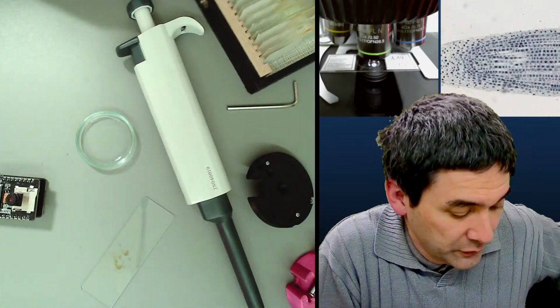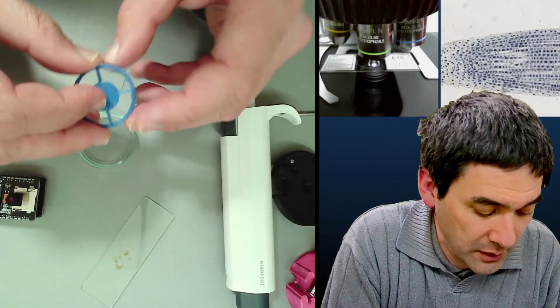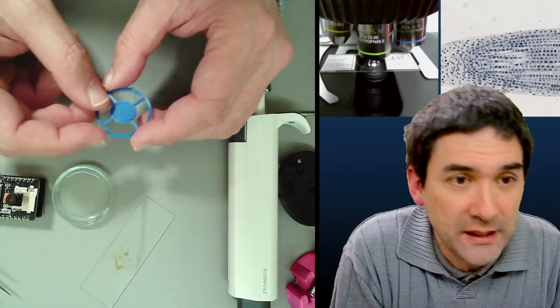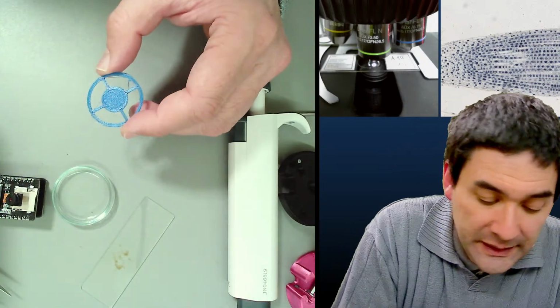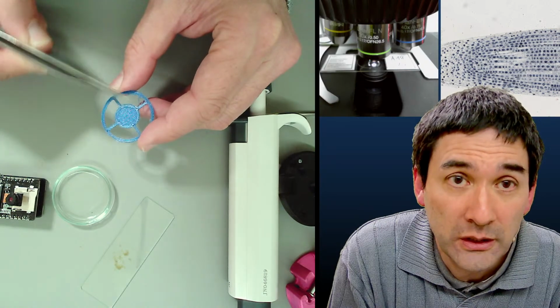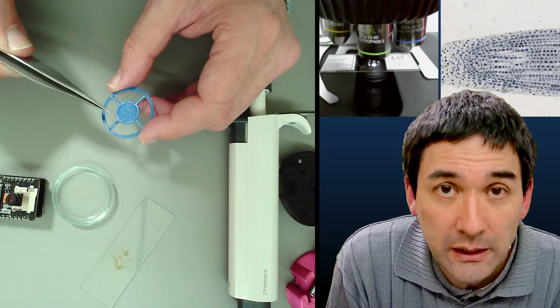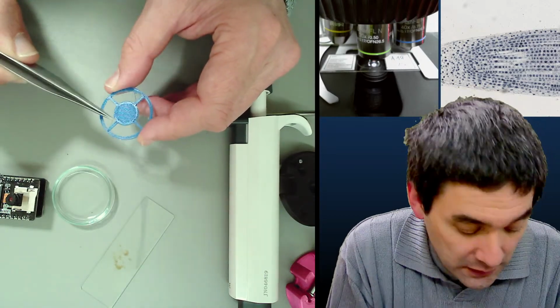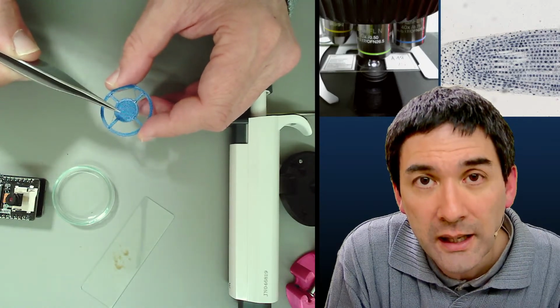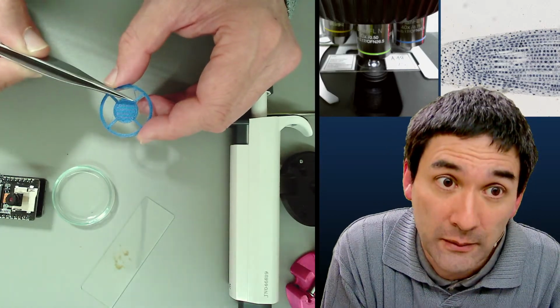But you don't have to 3D print it. Actually, I used a blue one here because I wanted to get a blue background and not a black background. Something that is really critical is the diameter. The diameter of the central disc is absolutely critical. Generally, the higher the magnification, the larger the disc has to be. And that's, of course, a problem because at a higher magnification, you already have a low amount of light, and then you're taking yet more light away, right?